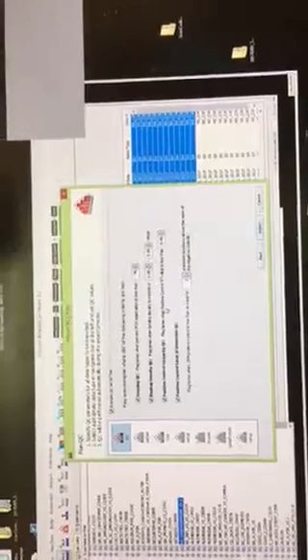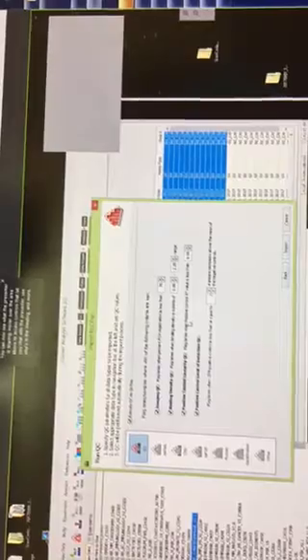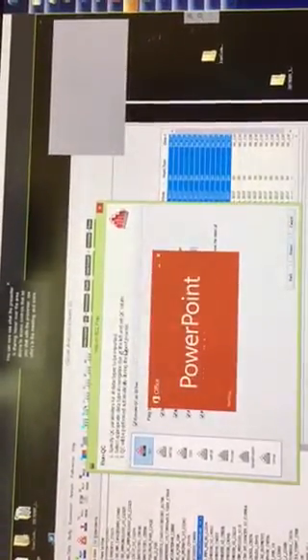So those numbers are usually the default, right? Yeah, they're default, and I think there's no reason to change the default as long as you understand what it means. There are some customers who apply their own QC metrics, at which point feel free to manipulate these, but I usually recommend keeping them as the default value.